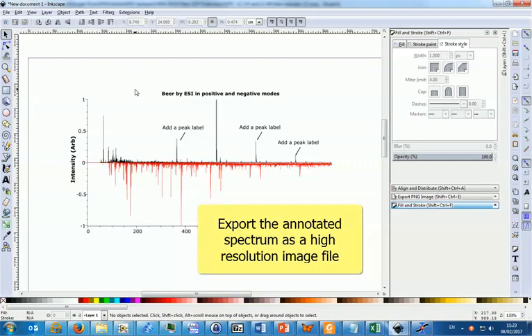Now you've created your fully annotated spectrum, we can save it as a high resolution image file, and we'll need to save that at 600 dots per inch, which is the requirement of most journals.